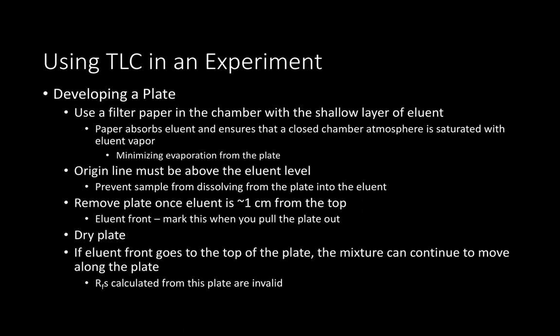The developing stage is when you're actually putting the TLC plate into your developing chamber and letting the eluent move up that plate or the solid phase. For developing a TLC plate, it's best to use filter paper in the chamber with a shallow layer of your eluent, about, as we've said earlier, less than a centimeter worth of solvent, which usually translates into a few millimeters, depending upon what you're using as your chamber. You do want that filter paper to be wetted with your solvent.